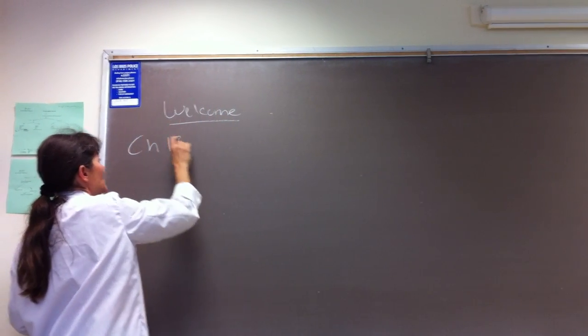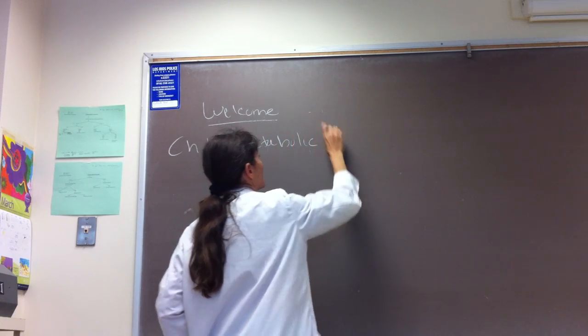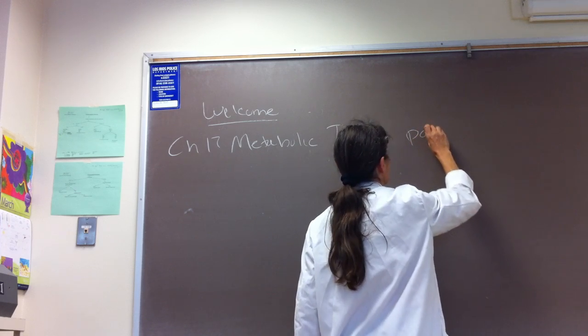Chapter 17, Metabolic Test Part 2. So we're doing follow-up on some of our tests.